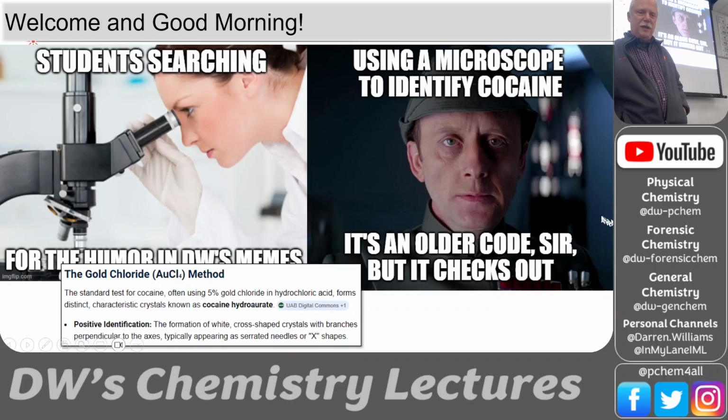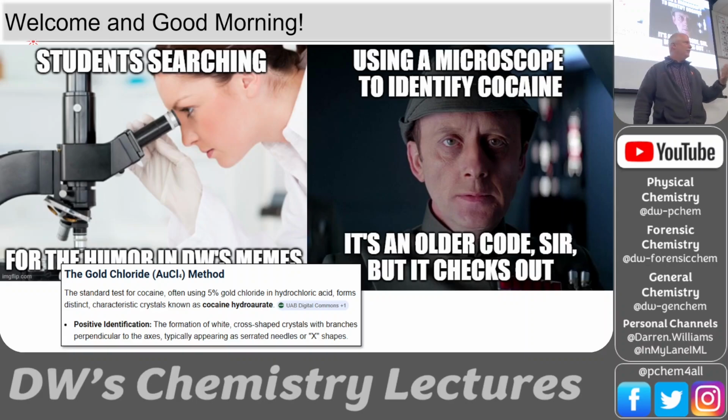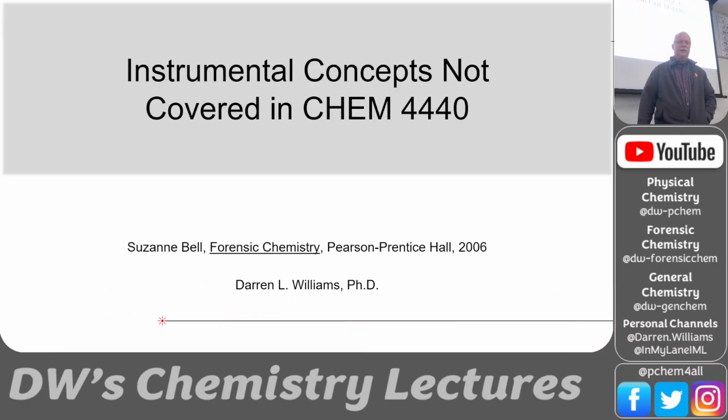So today we're going to be talking a little bit about microscopy. The one on the right is using a microscope to identify cocaine. Why would you do that if you have all these techniques like liquid chromatography, gas chromatography, and all of these other kinds of things? Why would you still use a microscope? Not only that, but the reagent for that test is expensive. It's gold and gold chloride. Can't we save money and do something more reasonable, like using an instrumental method? So we'll talk about that a little bit.